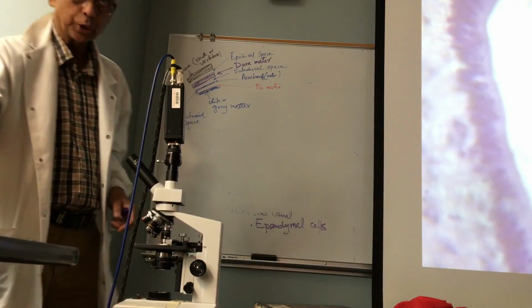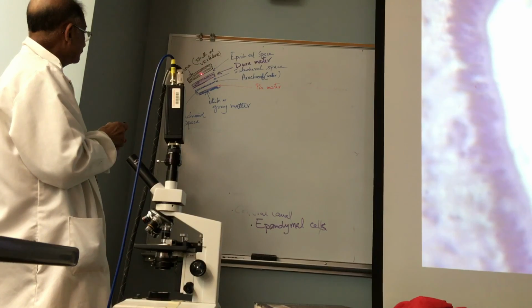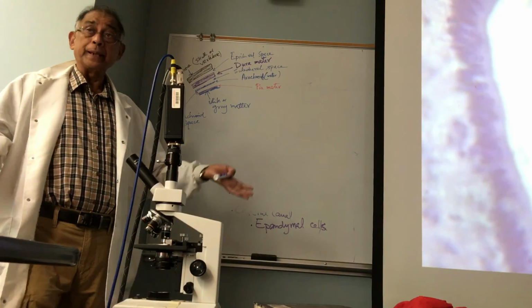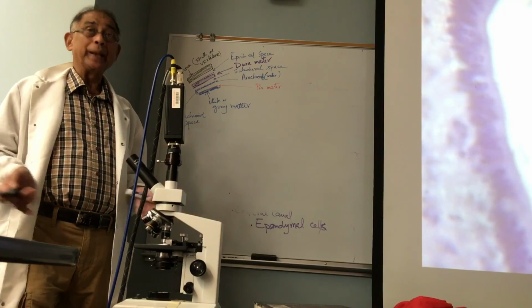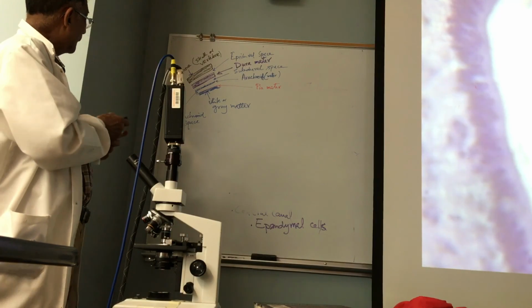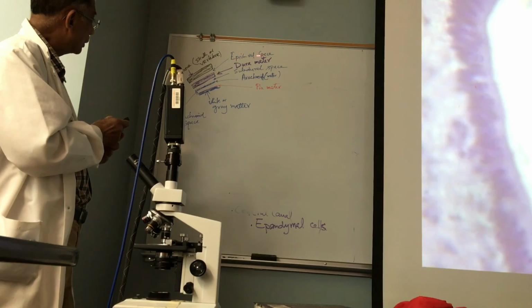It's very logical. This is the bone that protects them. It is a cranium. If it is cranium, it will be in case of brain. Vertebra will be in case of spinal cord. This space between dura mater and the bone is called epidural space.